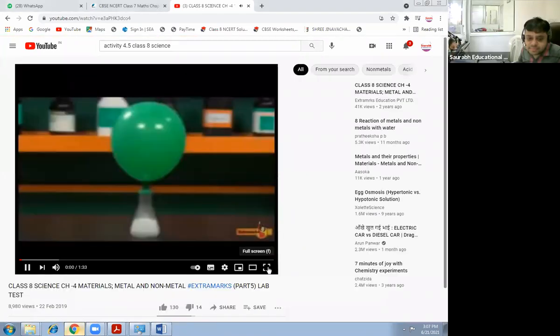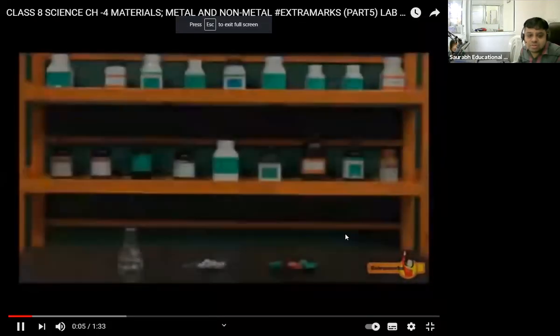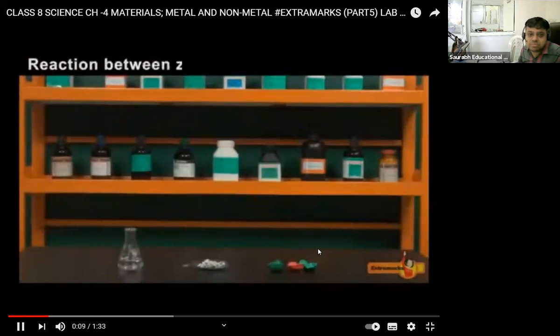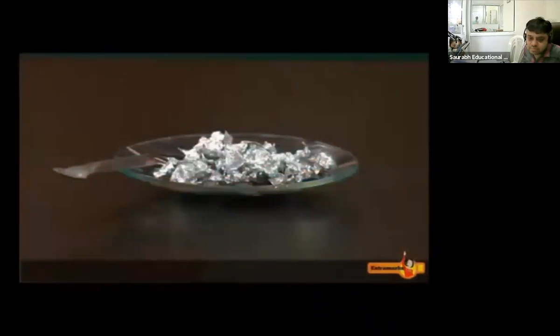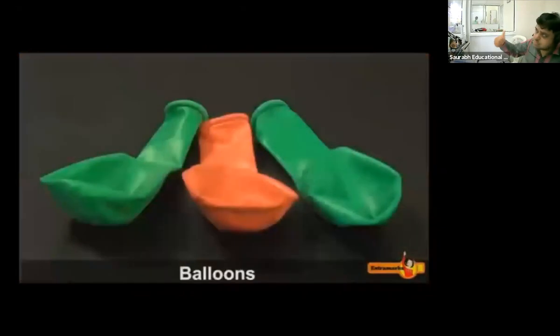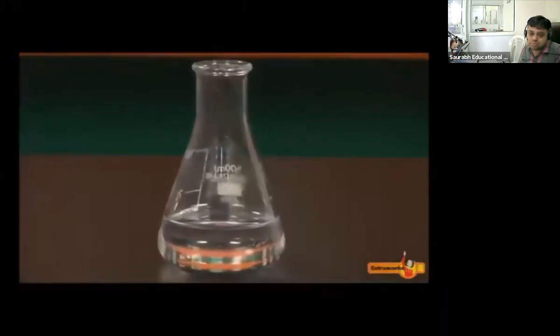Now see, here we will perform an activity to understand the reaction between zinc granules and dilute sulfuric acid. Metal and dilute sulfuric acid. We need zinc granules, dilute sulfuric acid, and balloons. Take a small amount of dilute sulfuric acid in a conical flask. Add some zinc granules into it.